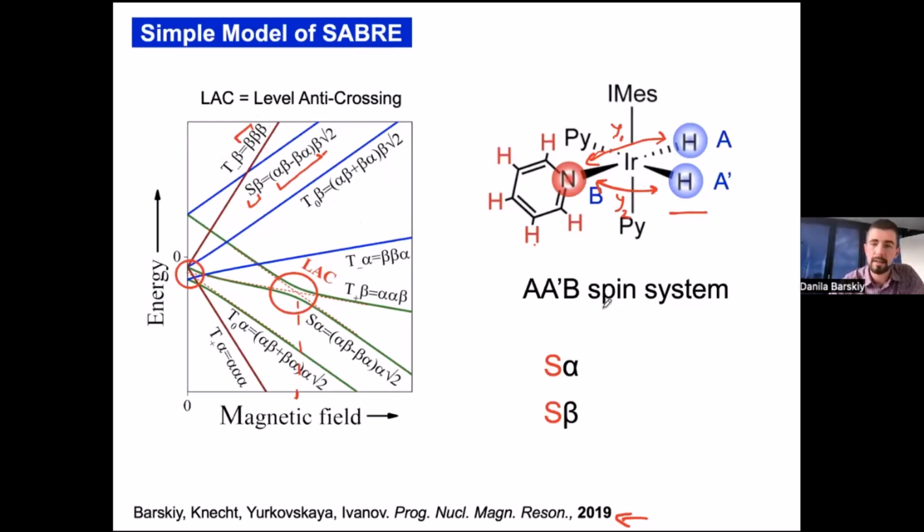The key idea is that by saturating the solution with parahydrogen, by bubbling hydrogen gas through your mixture of chemicals, you actually overpopulate singlet states in this system. So among all of these levels, singlet alpha and singlet beta will be overpopulated because your third spin is not polarized. You can say in the first approximation, alpha and beta are equal in energy.